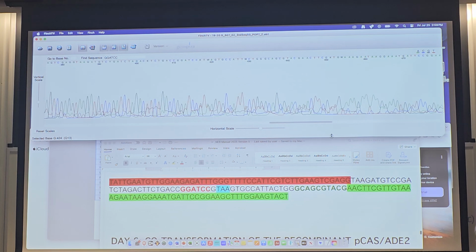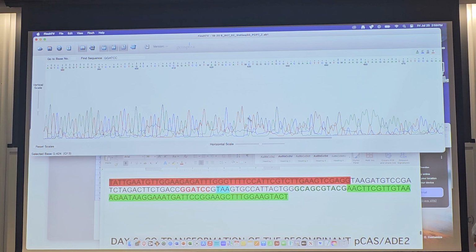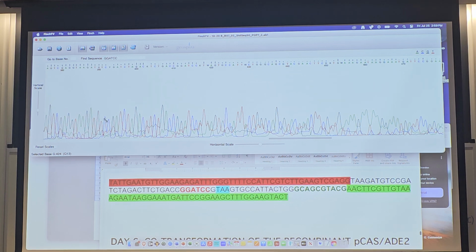We've been working with Ricardo on this and trying to figure out what's going on. Still not clear. So we swapped out all those reagents. That didn't do it. We still have kind of messy sequence here, and I'll show you what I mean in a second.